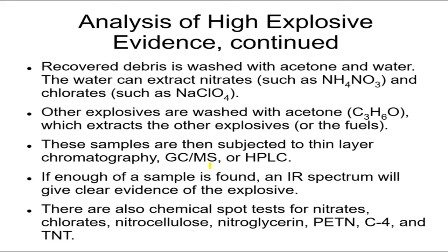Compound is identified by its mass. So we have this stuff in a solution. We send it through the GCMS. We're going to get the compounds that are in there, and that's our confirmatory test. We know exactly what it is once we go through the GCMS.